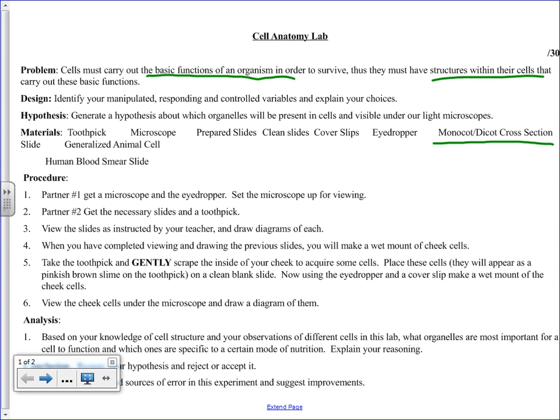Okay, and I'll show you what a picture of that looks like in just a minute, but for you auditory people, what you're going to see there are essentially very long rectangular plant cells on the top, and then some less rigidly shaped plant cells underneath that. You're going to be wanting to draw the rectangular shaped plant cells. And in them, you will very clearly see a lot of organelles. You will very clearly see a nucleus. You will very clearly see several chloroplasts.